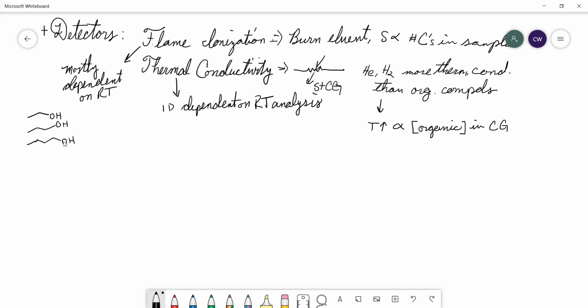You see there are a lot of assumptions there. But what you can't tell is whether that is isopropanol or regular propanol. Is that one butanol or two butanol? If you're dealing with isomers, good luck. And even then, your retention time's not going to help you.